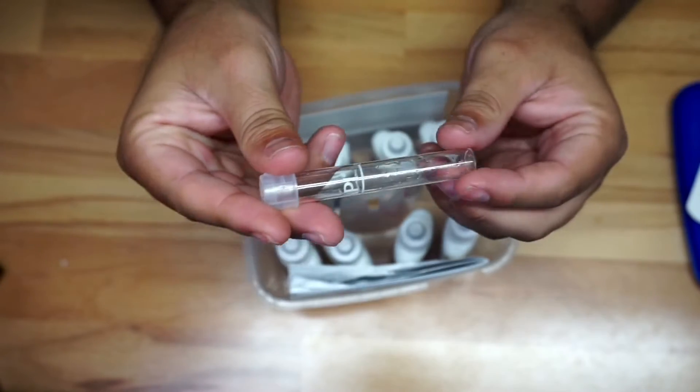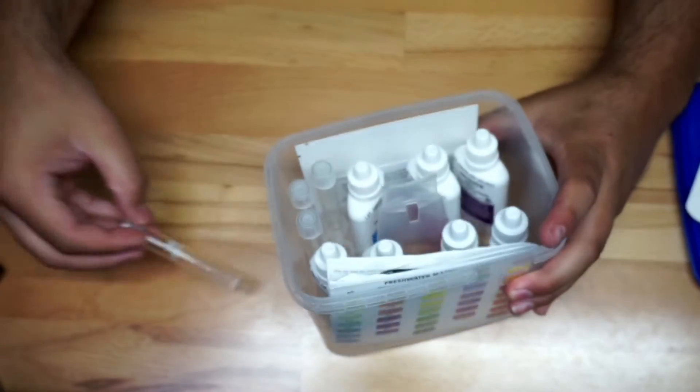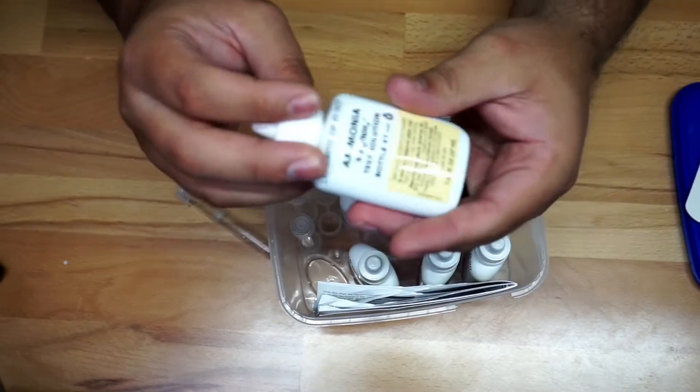API is very common in the aquarium industry. They make all kinds of different products. So I'm going to put this back in here. I think I'm going to just put some of this out here just for you guys to see.